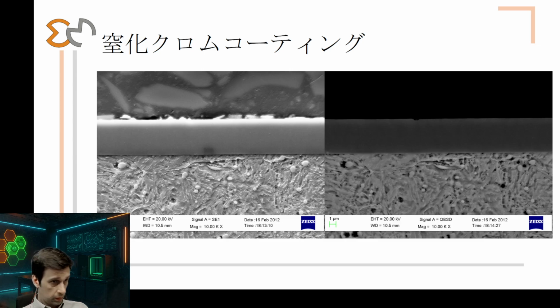and in the right image, the intensity of color basically depends on the atomic number. That's why the top region, which is resin, so it's mainly carbon, is light and looks completely black.